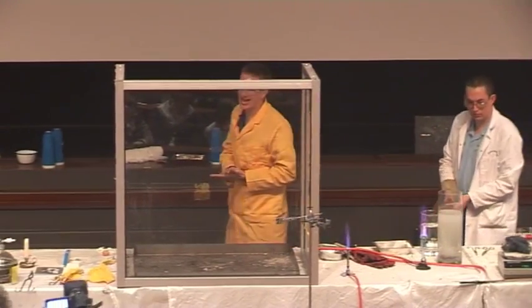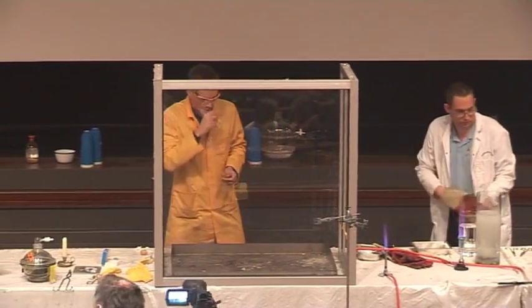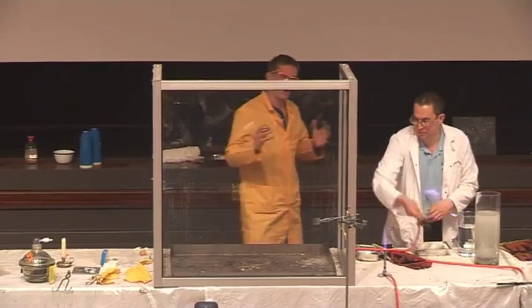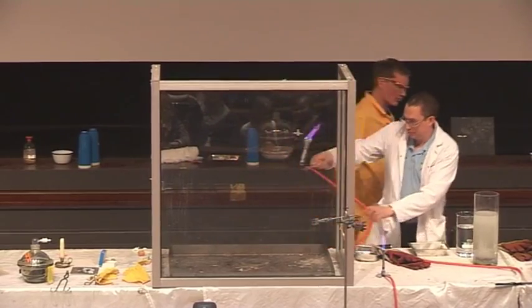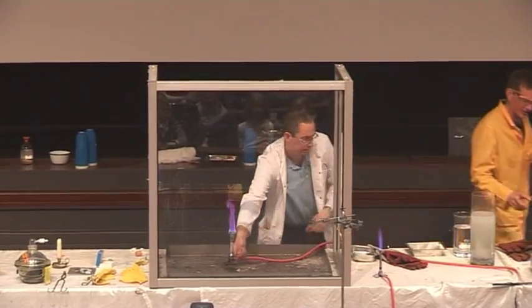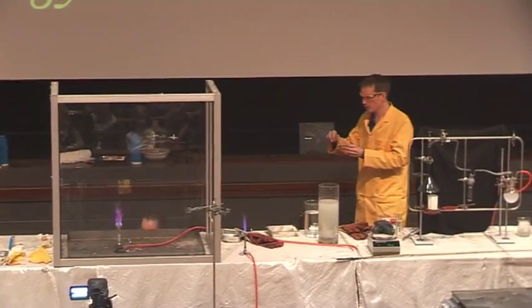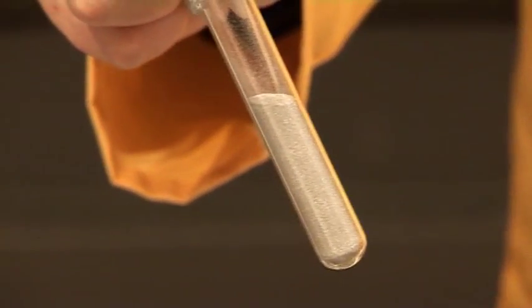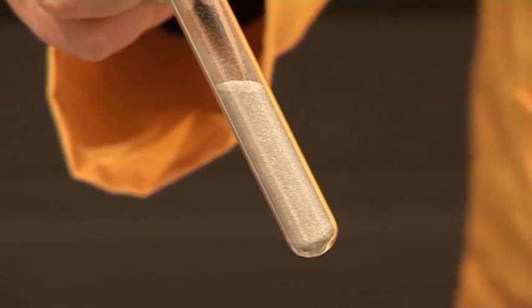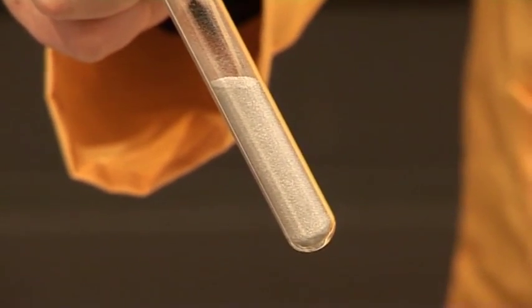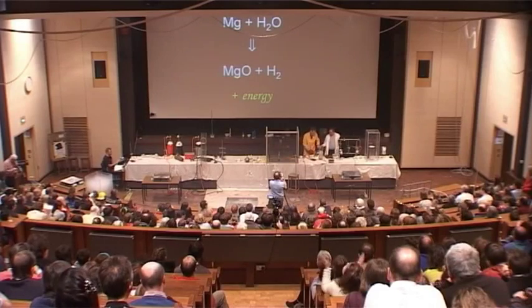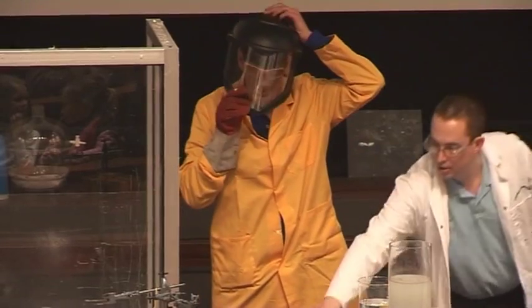We're going to see now if burning magnesium reacts with sand. Sand is silicon dioxide, and in this tube here I have magnesium powder and silicon dioxide — I have normal sand. Let's see if this can put it out.